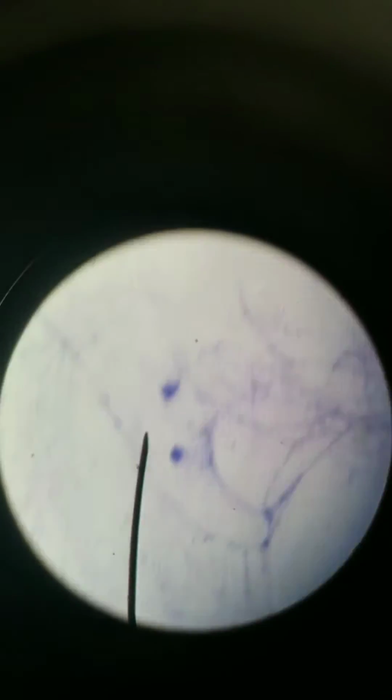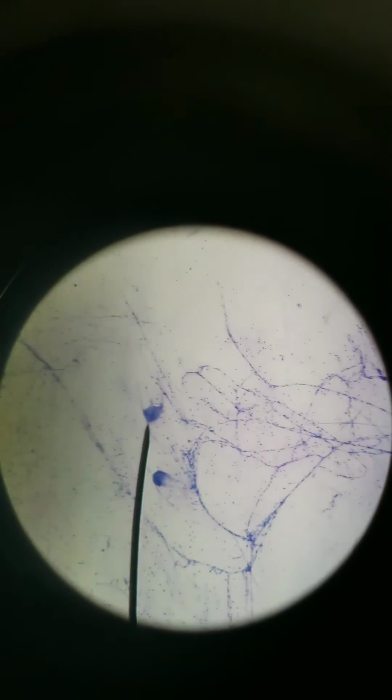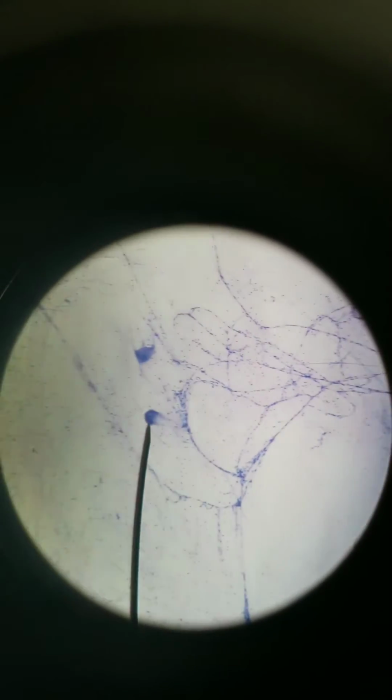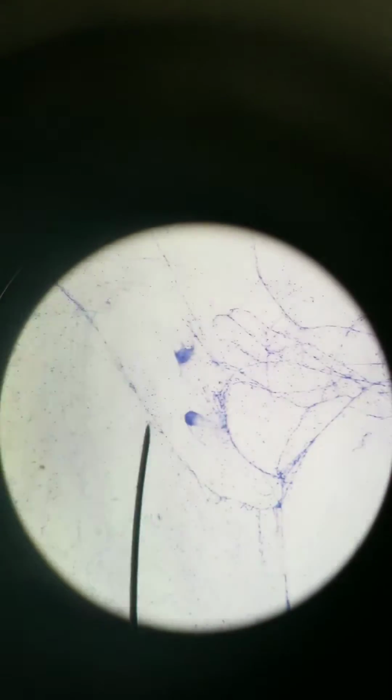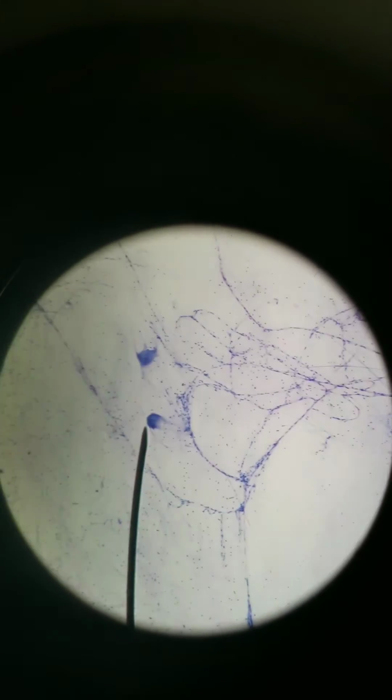We're at 40x right now. Excuse the shakiness. There's something going on with the table here. All right, we're at 40x total right now. Going to 100x. Get this into focus. And we can see the cell bodies of the neurons. There's one cell body. There's another cell body. You see lots of other dots. Those aren't neurons. Those are cell bodies of glial cells. And we'll get to that later.